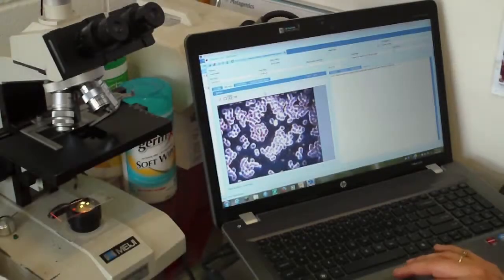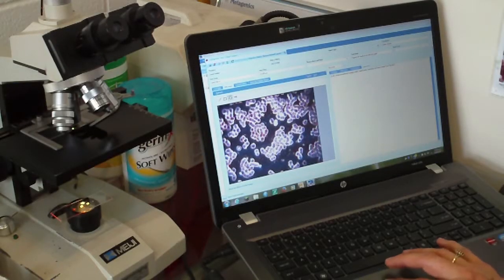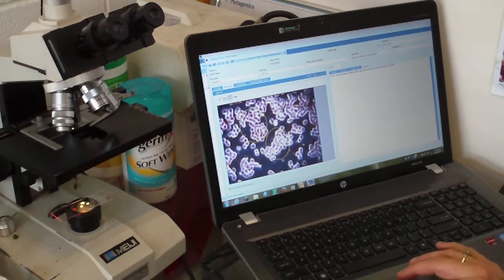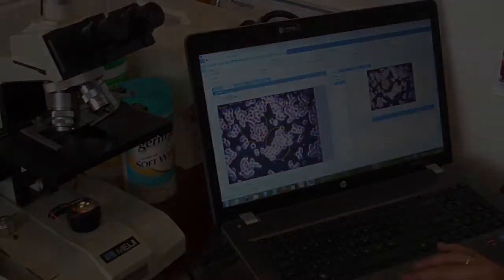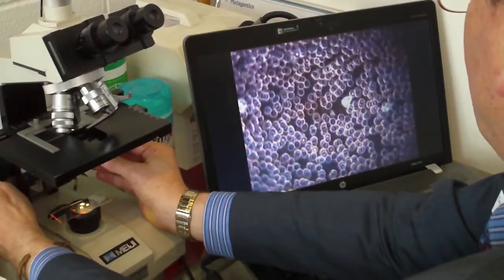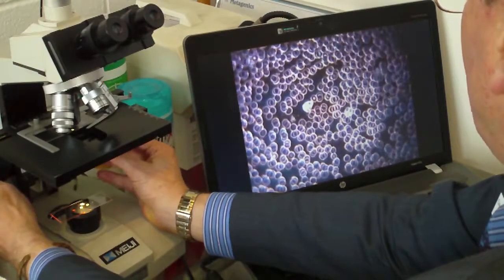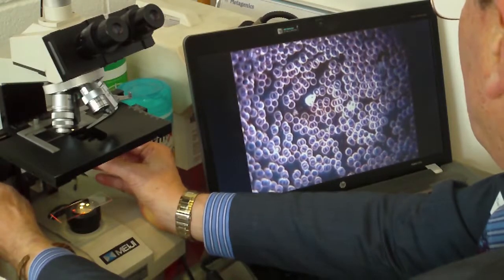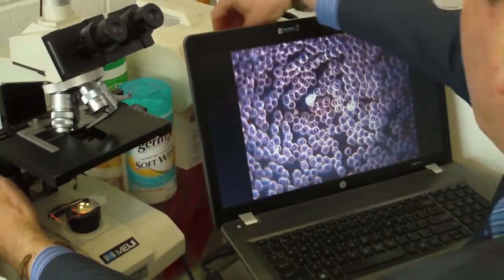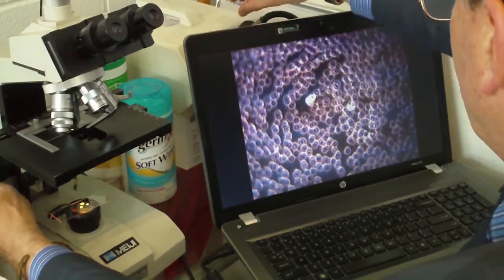And the detective work and the skill of the practitioner is to find out what's causing this and to eliminate it. So I'll capture the image. This is a little bit, it's not as severe as many that we see in seriously ill patients. It's a sign of a generalized stress response, which would be right. So this is where the blood's getting a little bit more separated. It's quite a dense specimen because this patient has particularly rich blood, very well nourished actually.